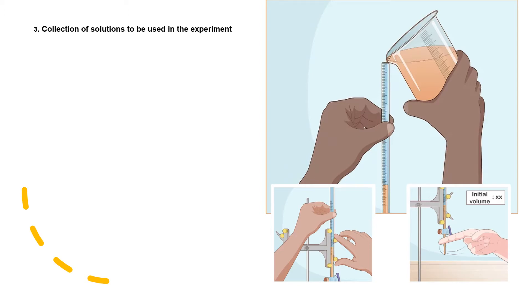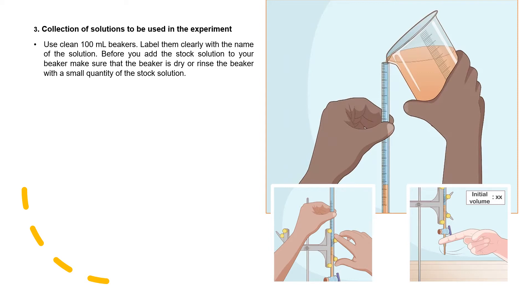Collection of solution to be used in experiment. Use clean 100 ml beakers, which you must label them clearly with name of the solution so that you don't mix it up with other solutions. Before you add the stock solution to your beaker, make sure that beaker is dry or rinse the beaker with small quantity of stock solution. Never pour excess solution back into the stock bottle. You are going to mess with the concentration of it.